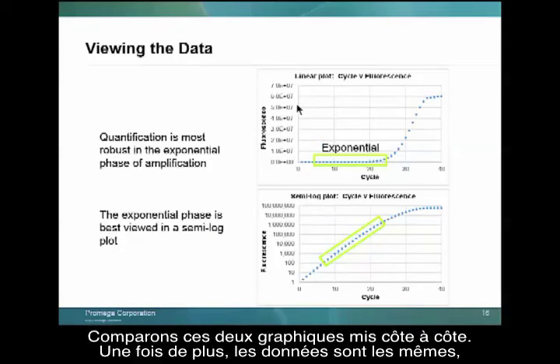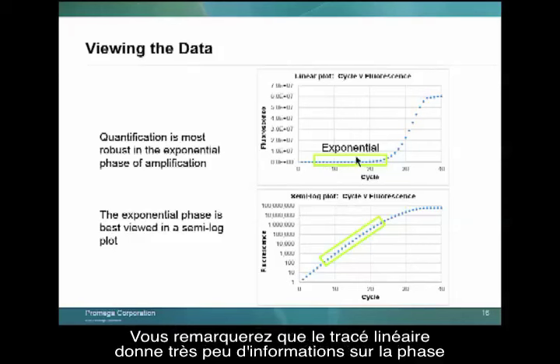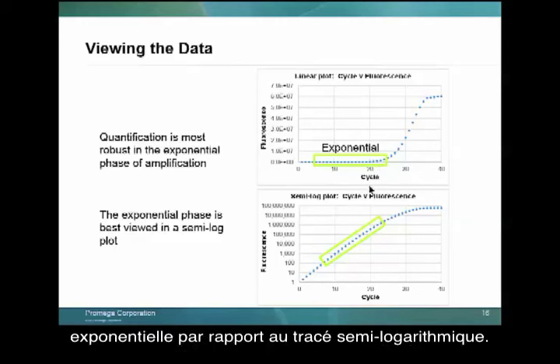If I compare those two plots side by side, again, this is the exact same data with the linear plot on top and the semi-logarithmic plot on the bottom. You can see how little information you get about the exponential phase from the linear plot versus the logarithmic plot.